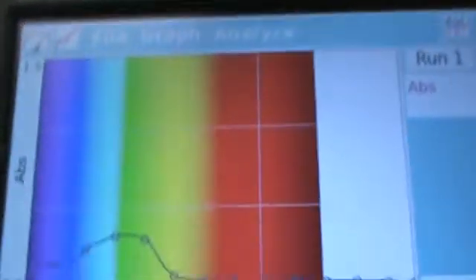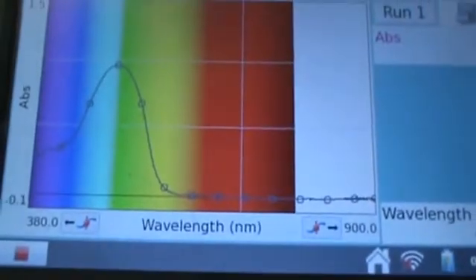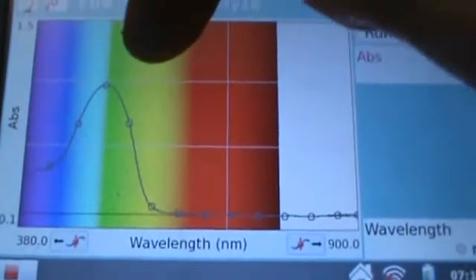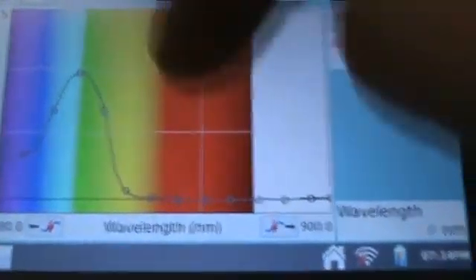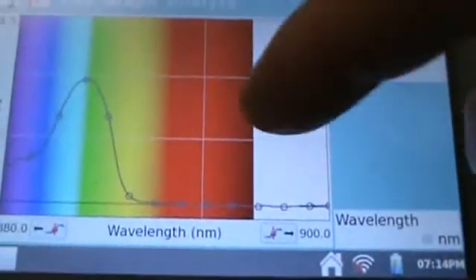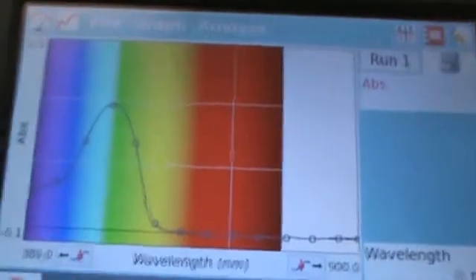Here is the red food dye. When we put that in here we see that we get absorption in the blue and the green regions because the red is being transmitted.